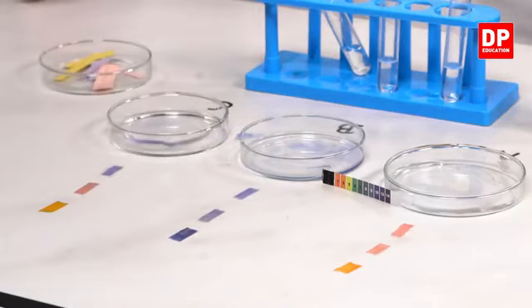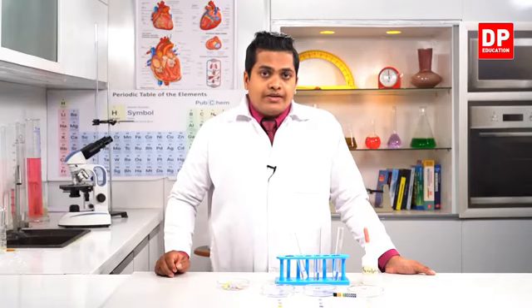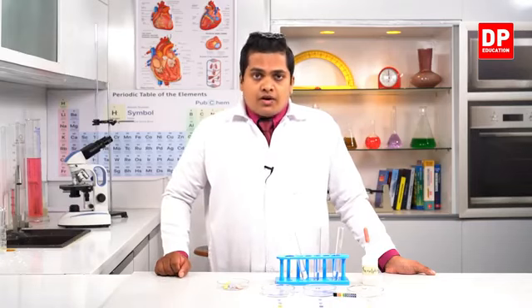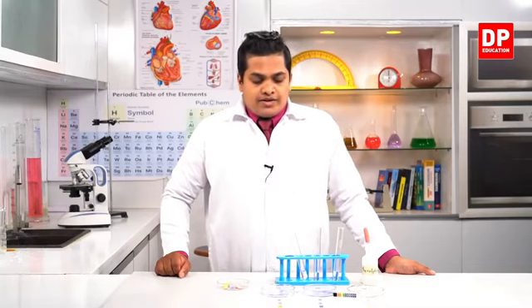All of these papers are getting converted to a blue related color. Red litmus is converted to blue color with the presence of a base, and pH papers also convert into a blue related color with the presence of a base.